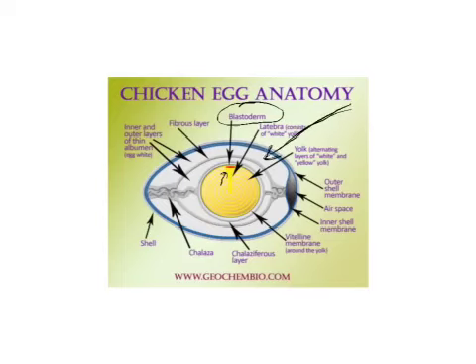chick is going to need is here in the albumin, and we talked about the amino acids earlier last week. But it's this annoying little part here, the shell, that we have to get rid of so that we can access this natural layer that we call a membrane. This membrane is semi-permeable, and in fact is very much like the membrane of the cell itself.